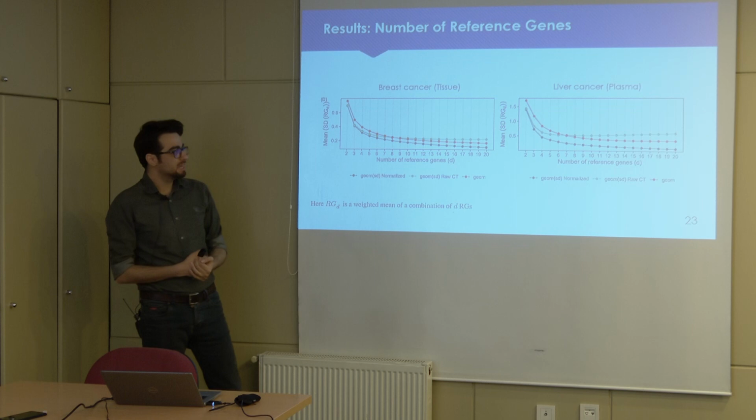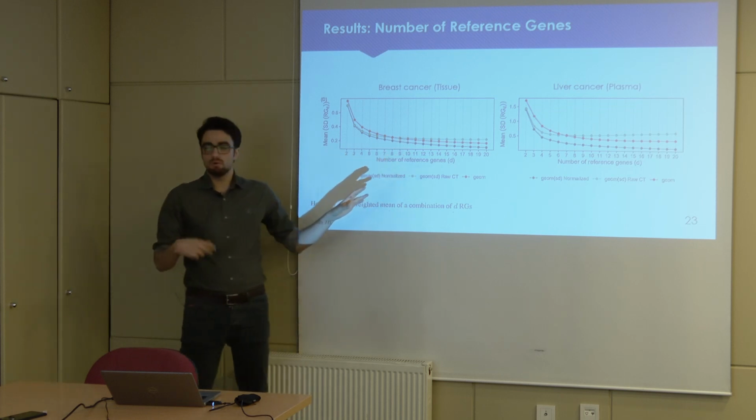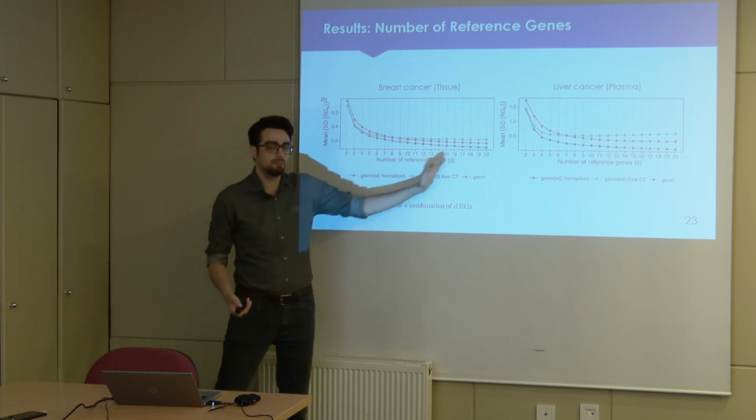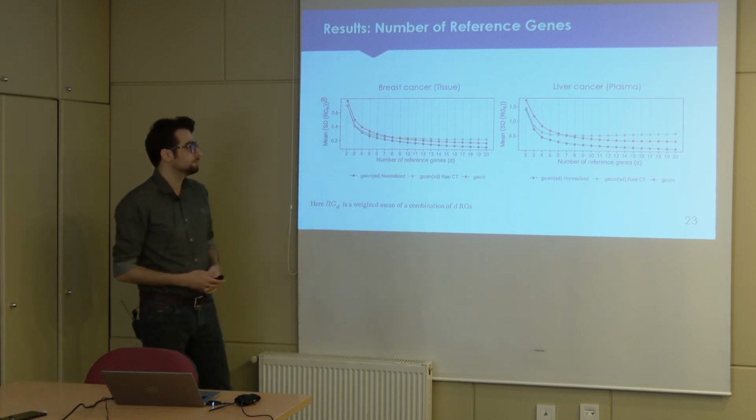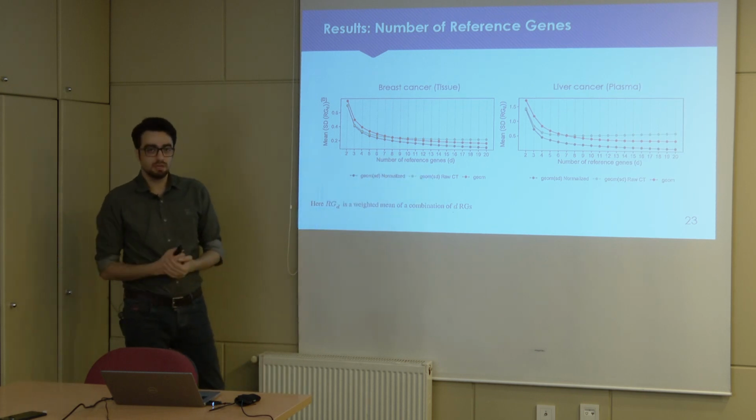And we think it might be due to some overfitting effect while the parameters go higher. Because more reference genes means more weight parameters.